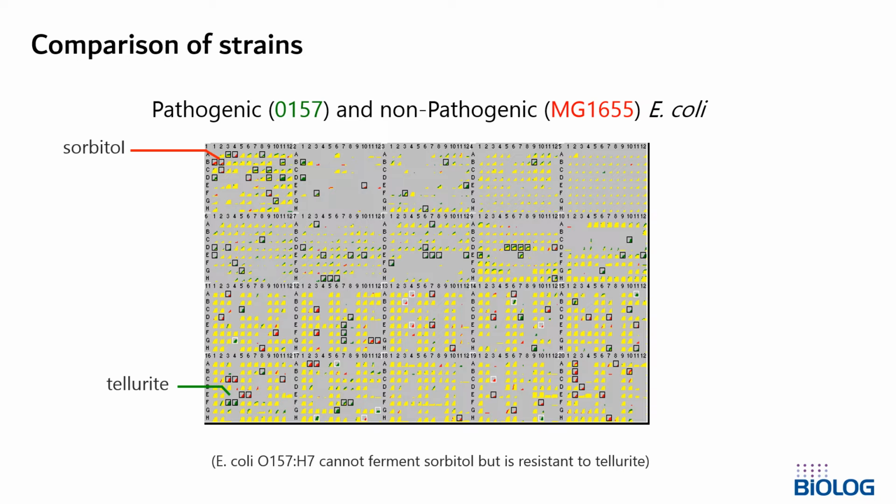So experiments like this can be really useful to determine changes in strains due to phenotypic drift. For example, if something feels off about your production strain, you can use these types of experiments to detect what those changes might be. And then later, you can also use this as a very comprehensive QC test to ensure the strain that you're working with today behaves exactly like the strain that you were using 2 years ago.